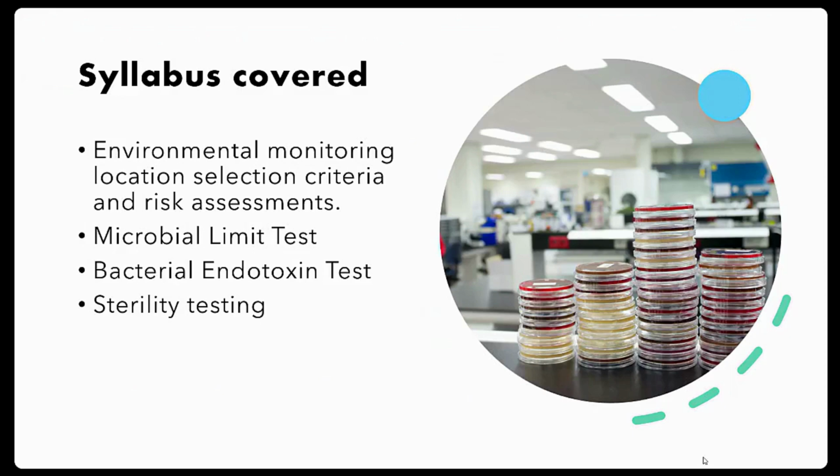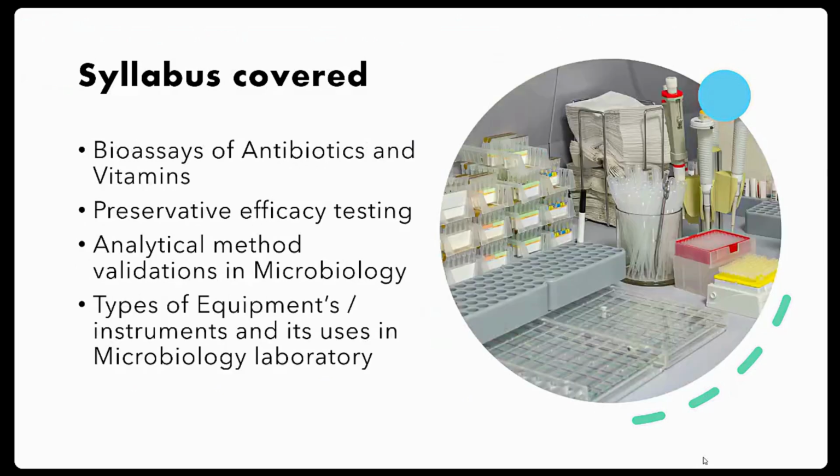What is sterility testing? In this testing, we will check the absence of microorganisms. This is for sterile products. Sterile products should be free from all living organisms. By sterility testing, we'll check whether there is any contamination in the sample or not.